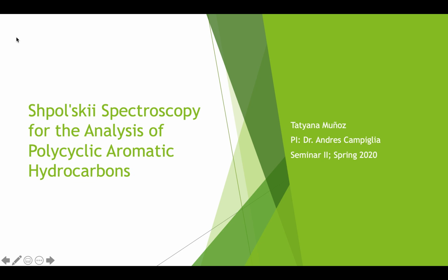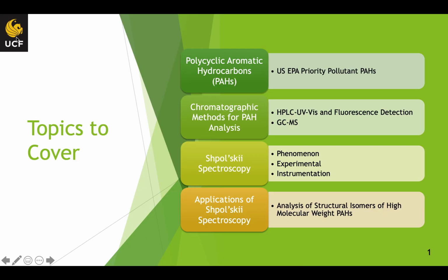My name is Tatiana Munoz, and the topic that I have chosen for my seminar presentation involves an analytical method known as Shpol'skii spectroscopy, and in this case, Shpol'skii spectroscopy for the analysis of polycyclic aromatic hydrocarbons, better known as PAHs. So a quick overview of the topics I will cover.